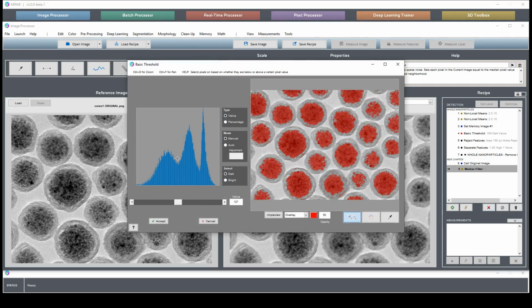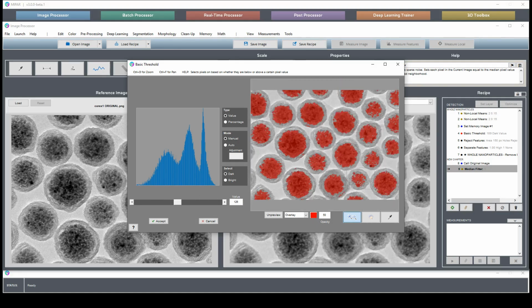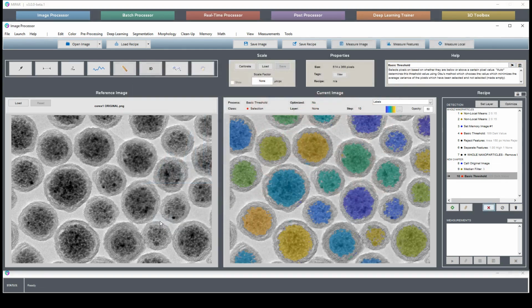So say we set our value right about here. Okay. 130, yeah, 130 looks like a good number. Most of these look pretty clean. Perhaps a little bit less to cut this off. Yeah, that looks good. And now we've got some cleaning to do.